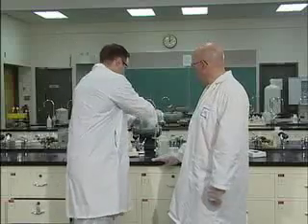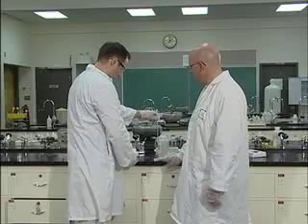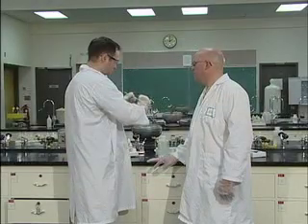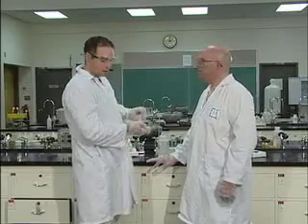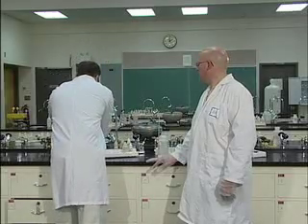Now, again, we're going to test it with the litmus pH paper. It's going to go blue. It's got to go blue. No? Well, depending on what the acidity of it is, it should go blue. Now, you may need to add a little bit more calcium oxide to get this type of reaction. Don't tell anybody I do this.